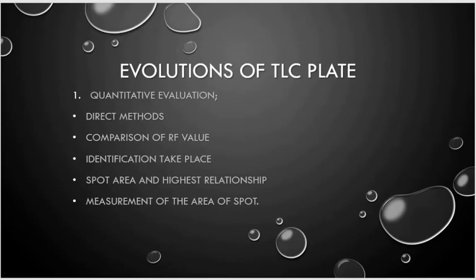Then we have the evaluation of the TLC plate, the checkup of the TLC plate. We have quantitative evaluation, direct methods, comparison of the RF values between the different RF values. We have to compare the RF values in different solvents. Identification takes place, the spot area of the highest relationship, measurement of the area of the spots. These all are the steps through which we can evaluate our TLC plate.